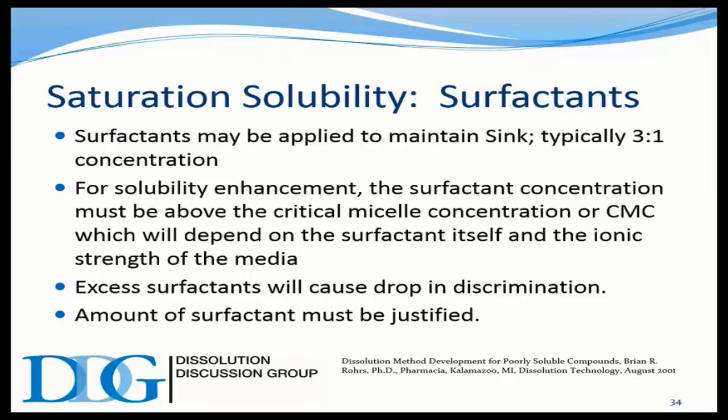But for solubility enhancement, surfactant concentration above that micelle limit will depend on the surfactant itself and also the ionic strength of the media. And of course, there's various surfactants that are basically able to pair with that drug as well. Some are more effective than others. Excess surfactants can cause a drop in discrimination. This is the primary reason that surfactant levels have to be justified.